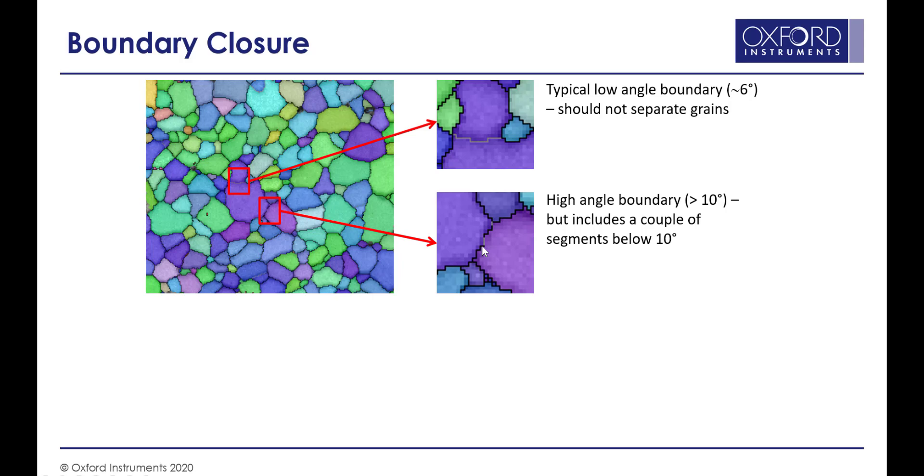Then it's got a couple of segments where that disorientation dips below the 10 degrees. We would normally consider this right-hand, more purple-colored grain to be considered as a separate grain. It just happens to have a similar orientation, and so the boundary is in places just below 10 degrees.